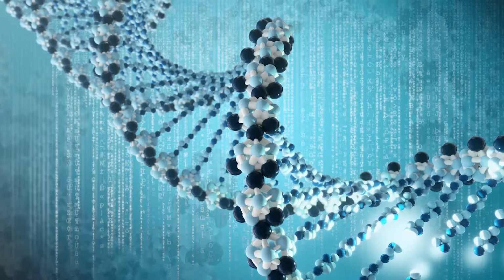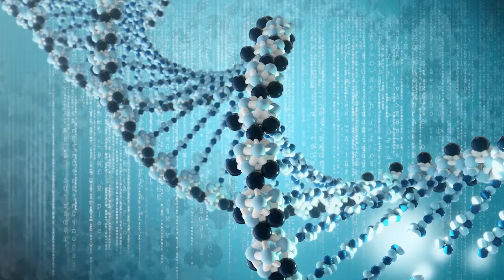What we're most excited about is just trying to understand how the virus works. And so I think that by getting information about how the key parts of the virus fit together, that may help other people who focus mainly on drug discovery. It might help them. We're using NMR to look at really large RNAs.